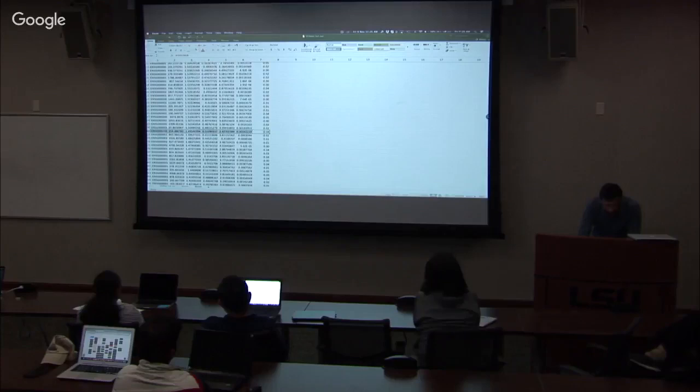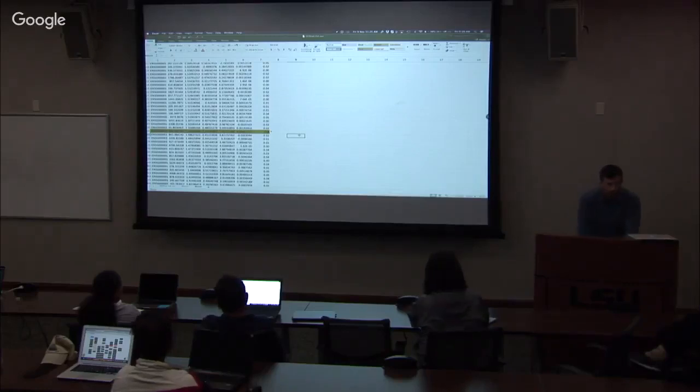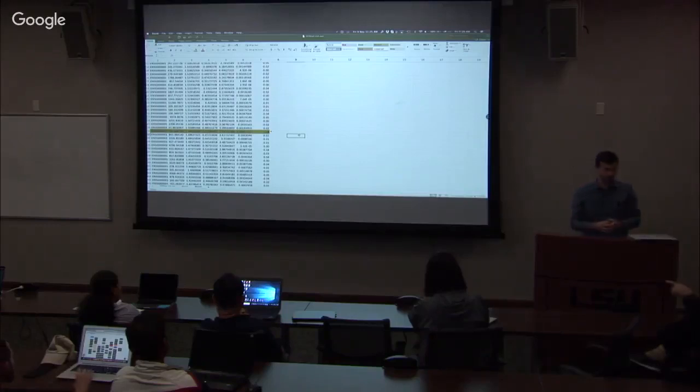In the second method, it's kind of bitwise matching, like in the row sequence for each read. Is it? That's how it compares. So in the second one, like differentiating? Well, you first do all the same stuff and create a table of expression. And then you do what we just did in Excel, right? We compare the means, see whether it's statistically significant. In the second one, still we are using that. Yeah. Well, not exactly, but yeah, the same principles.